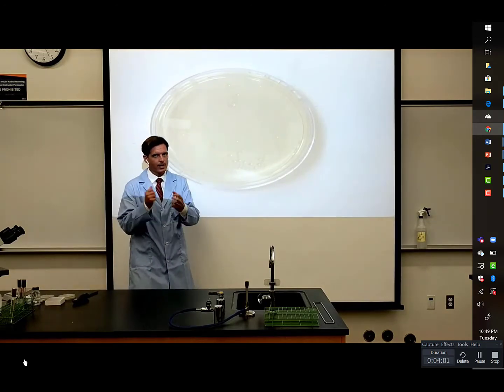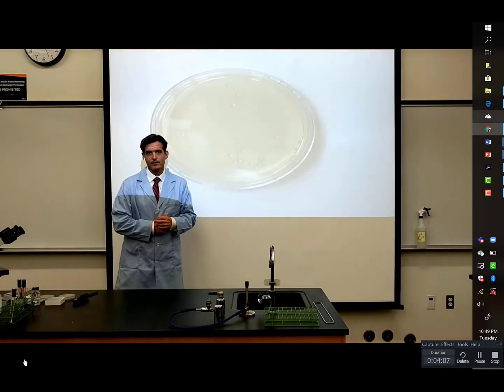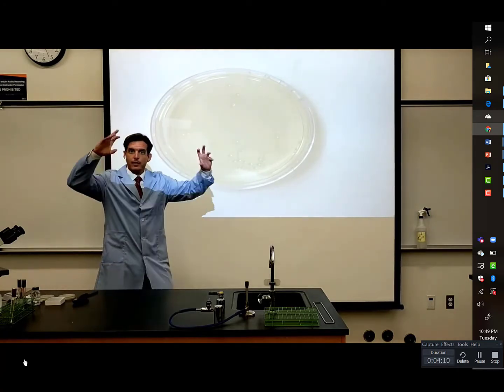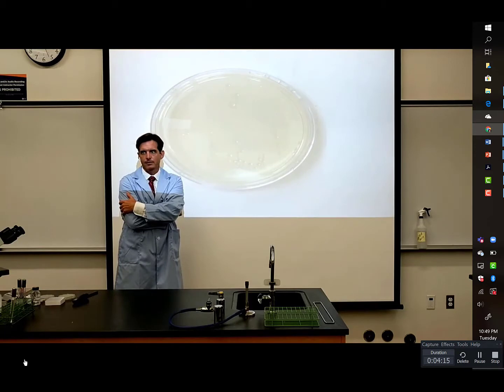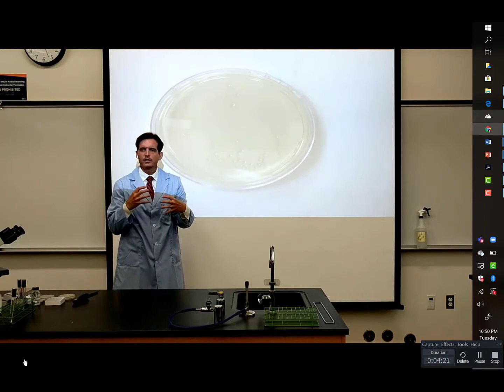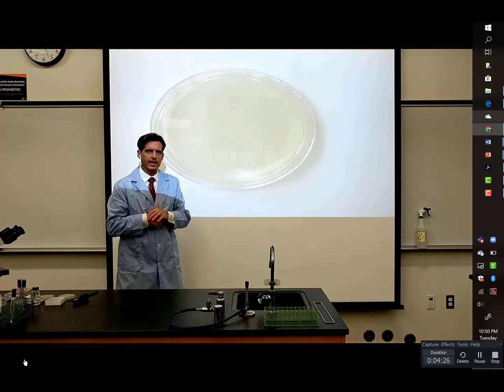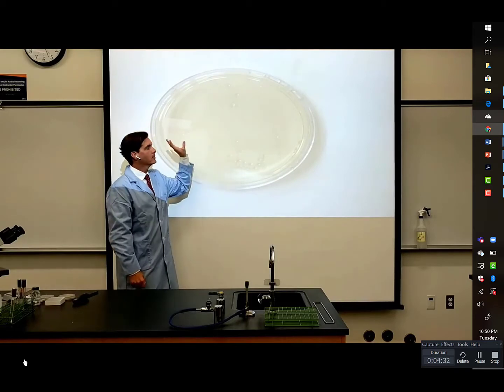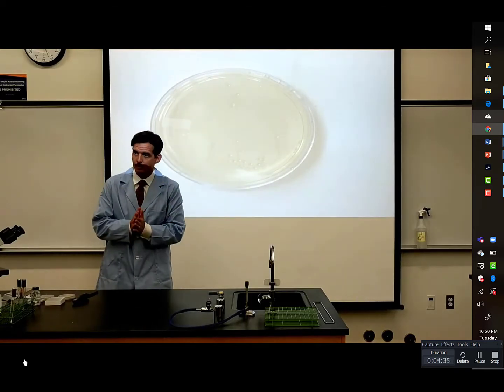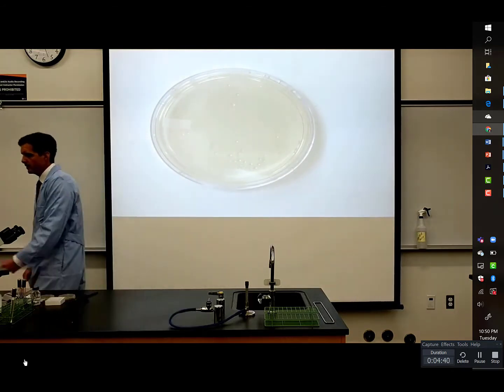Now, I took a risk when I opened the plate to the air, and that's something that maybe we can test as well. Some of you might have heard that germs can float through the air, right? We're worried about that with COVID-19, right? What if someone who's infected is in a room with closed air where viruses could be floating in that air, and then someone else could inhale them. And in this case, we're going to be opening these plates. We're not going to be able to grow viruses, but we are going to be able to grow some bacteria. And speaking of the air, let's test the air. All right. So I've already opened the plate a little bit anyway.